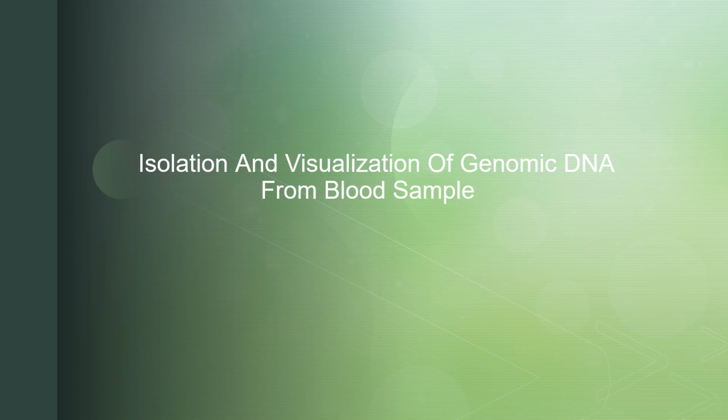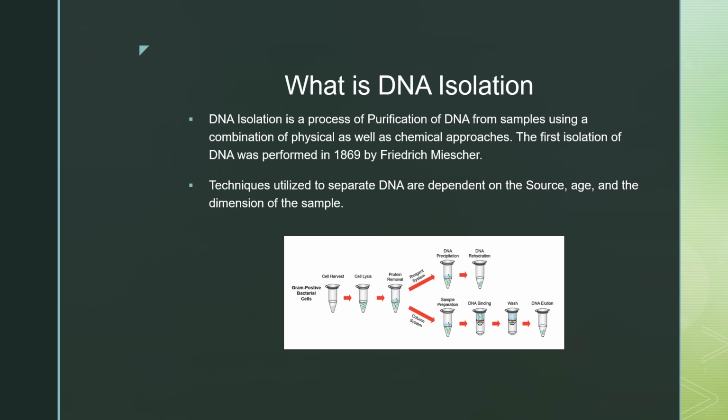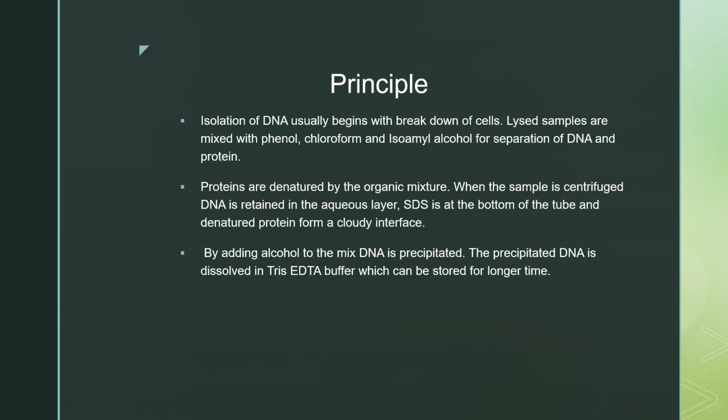Now we are going to learn about isolation of DNA from blood samples. What is DNA isolation? DNA isolation is a process of purification of DNA by using physical as well as chemical approaches. The first isolation of DNA was performed in 1869 by Friedrich Miescher. Techniques used to separate DNA are dependent on the source, age, and dimensions of the cell.